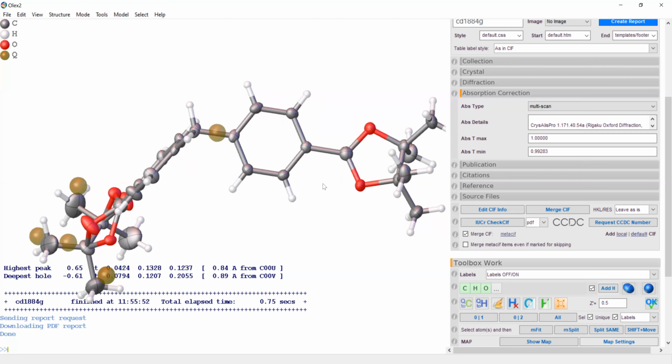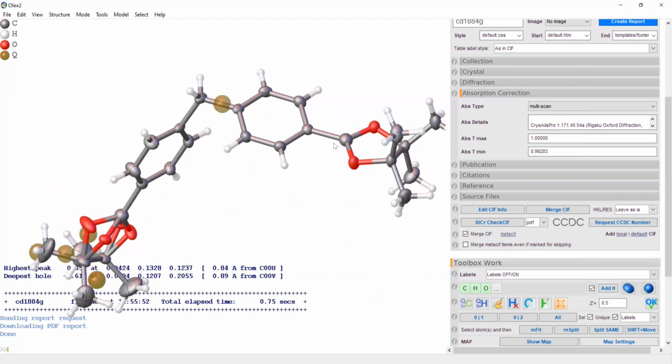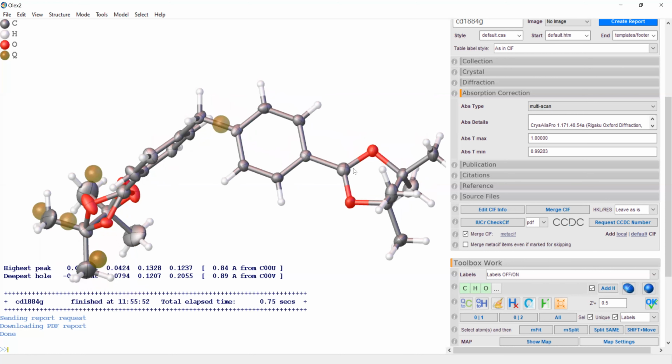So what I'm trying to show you is that if this is a carbon and we have 3 single bonds, well, then what's missing from this carbon atom? If it has 3 single bonds, it must have a hydrogen atom. And so what we can do is see here, is there a hydrogen atom off of this atomic site?